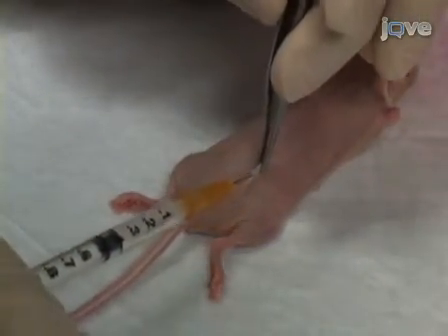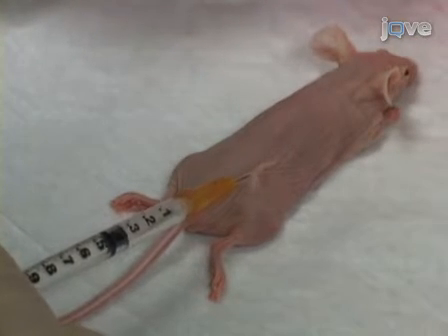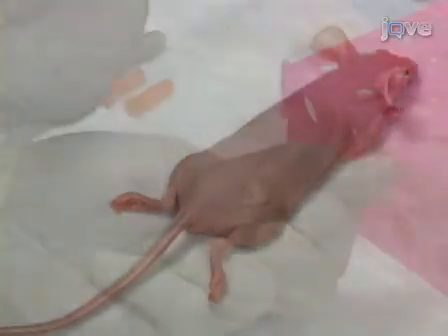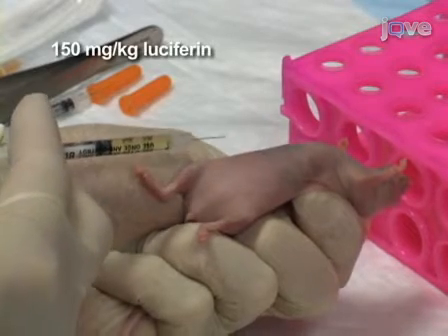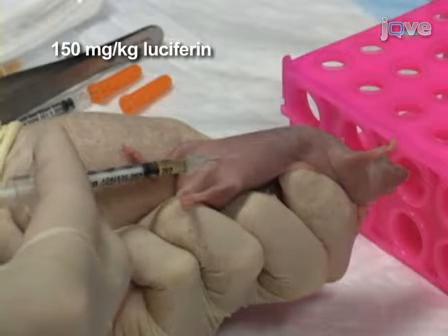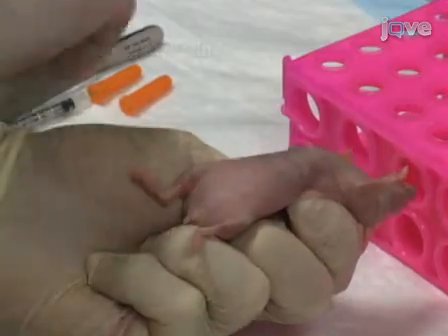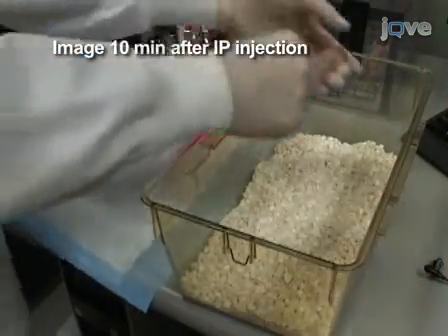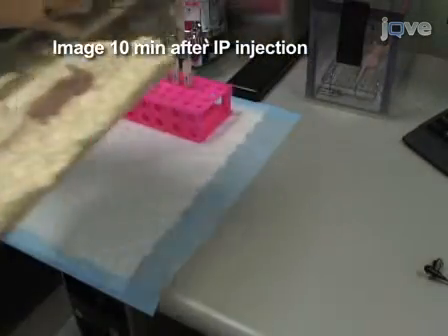Lift the skin gently with forceps to make a tent and inject the cells at the base. The newly injected cells can be imaged immediately. A total of 150 mg of luciferin per kilogram body weight is then administered via two injections into the peritoneal cavity. Animals are imaged 10 minutes after luciferin injection to ensure consistent photon flux.